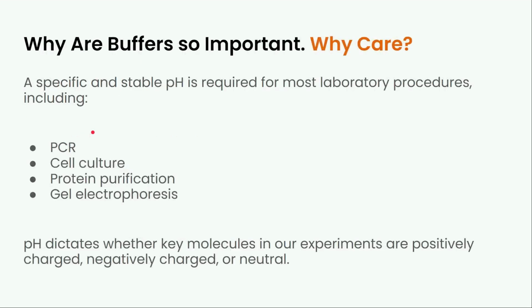But before we dive into anything really technical, it's worth stopping to consider why buffers are important. Why should we care and bother to understand them? Well, if you think about it, there's almost nothing we do in the lab that doesn't require a specific and stable pH, which is what a buffer gives us. So here I've listed a few examples: PCR, cell culture, protein purification, gel electrophoresis, to name a few, enzyme assays, DNA purification, Western blots. They all require a specific pH to work.